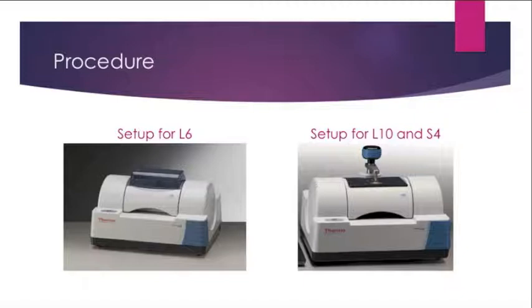An infrared spectrometer was used in this experiment. It was linked to a computer and the information collected was plotted. The first liquid unknown was run in a spectrometer using a sodium chloride salt plate. The unknown was dropped onto the plate and the other plate was secured on top. It was placed in the IR spectrometer and the sample was tested.